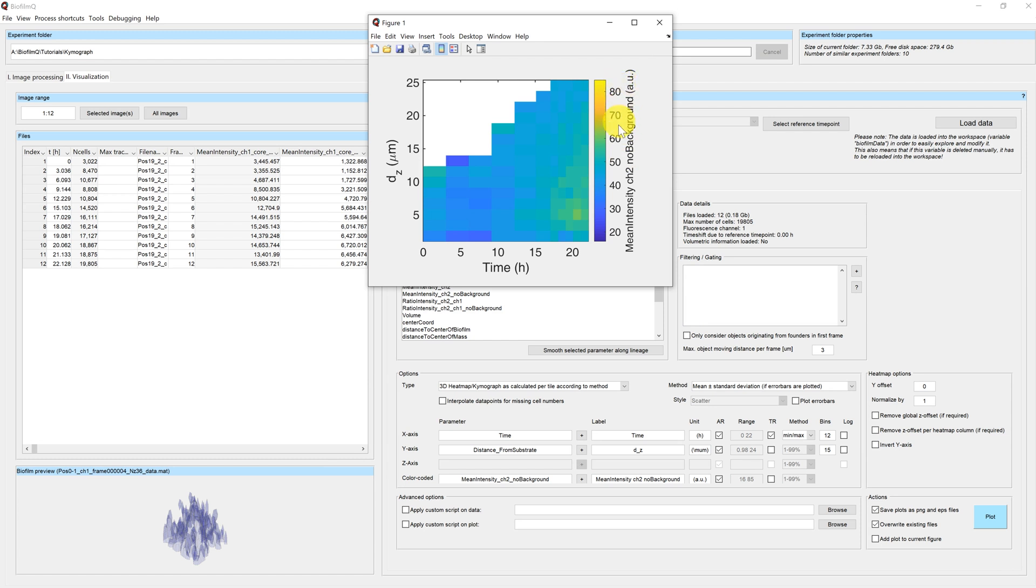Our color code is the mean intensity of channel 2, which corresponds to the gene expression reporter. And therefore we can see the reporter activity, how it changes over time, and how it changes according to the biofilm height.